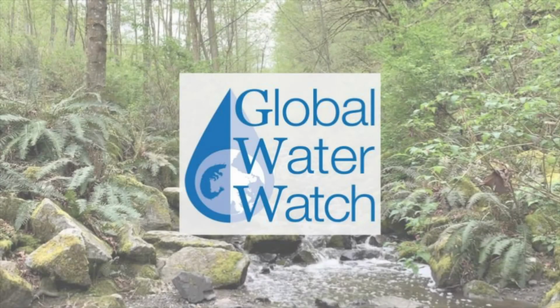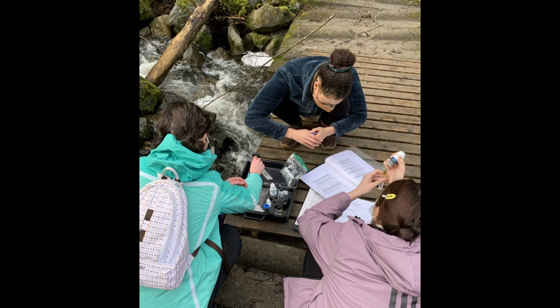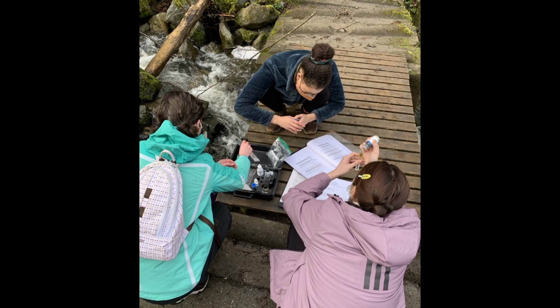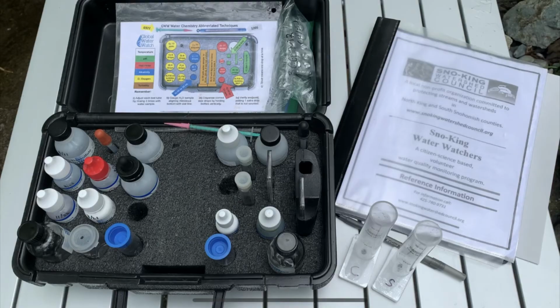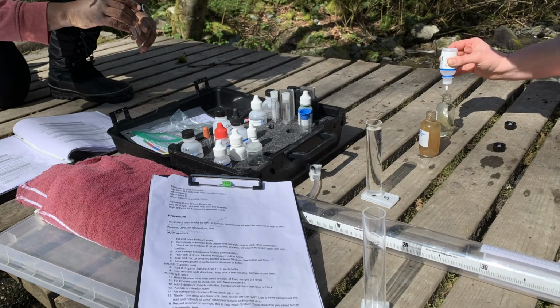We will be monitoring the physical and chemical properties and the bacteria levels of the water. All of these tests today are performed following the steps in the Global Water Watch protocols. Global Water Watch is an organization that empowers citizens to protect and restore their local watershed through education and training using simple techniques with inexpensive standardized equipment that helps them gather credible water data.